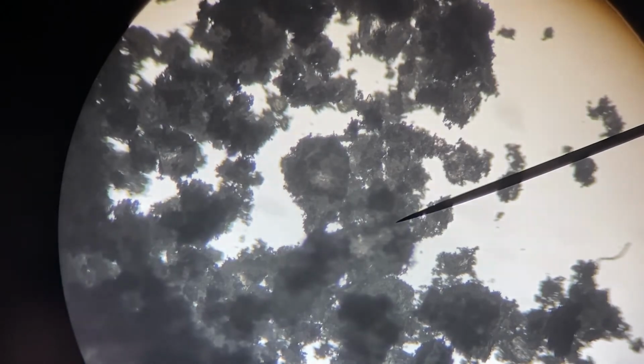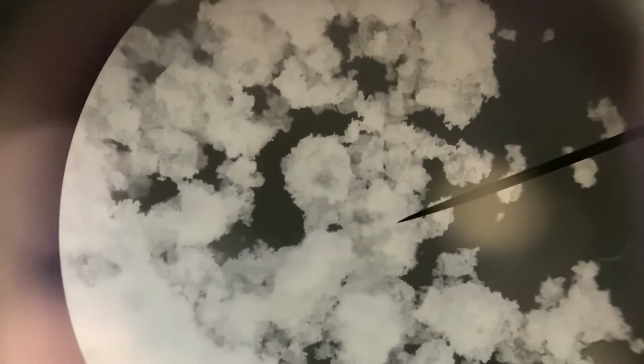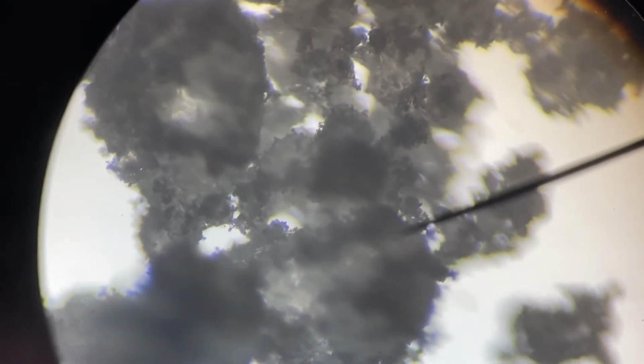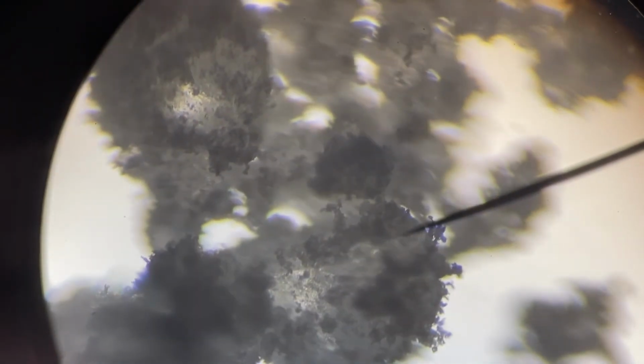Let's see what it looks like with the light off. Okay, yeah, it looks like chunks of powder, like snow or something like that. Let's see if I can do it on my next objective. This is about 100 times the size of what it actually is. Okay, oops, I moved my coarse adjustment. Let me try my fine adjustment. Let's see if I can go even one higher.